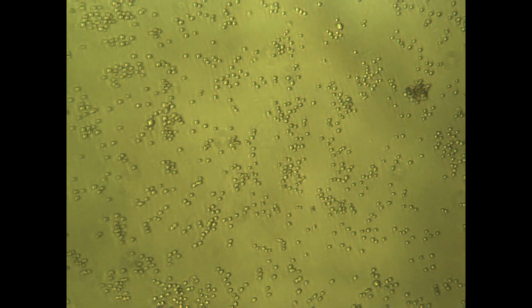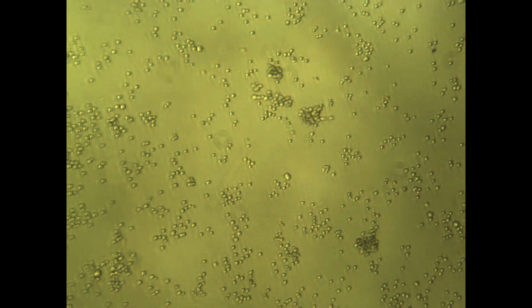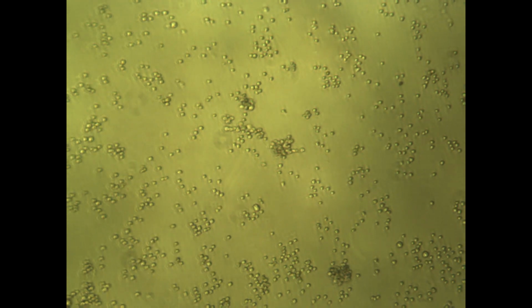Hey, wait a minute, that looks completely different. Why are those cells moving? And they're all rounded up. In fact, you only see a few that are still attached or partially attached.